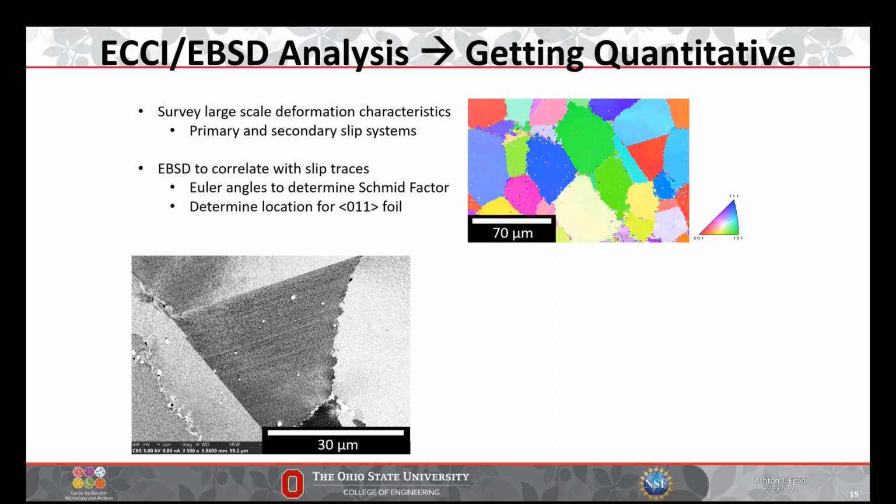Okay. Why don't we observe the beta phase in titanium EBSD? So in this one, it was a low beta kind of heat treatment, so there wasn't much to observe. And as such, I didn't index it. I only chose alpha as the one that I was indexing, knowing that there wasn't beta there. That's basically the short answer.